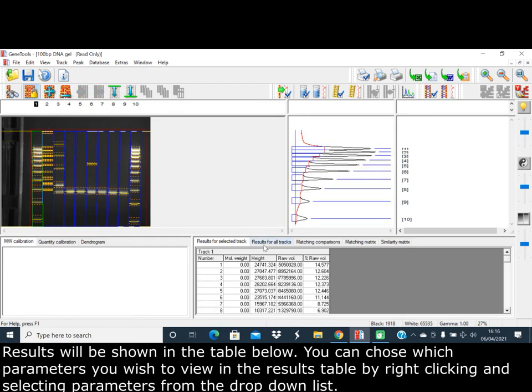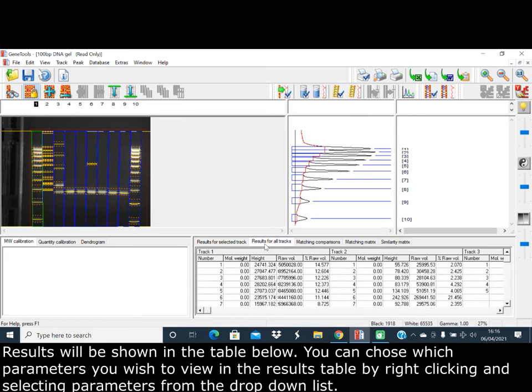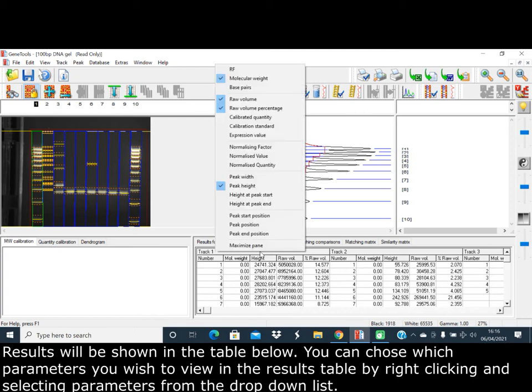Results will be shown in the table below. You can choose which parameters you wish to view in the results table by right-clicking and selecting parameters from the drop-down list.